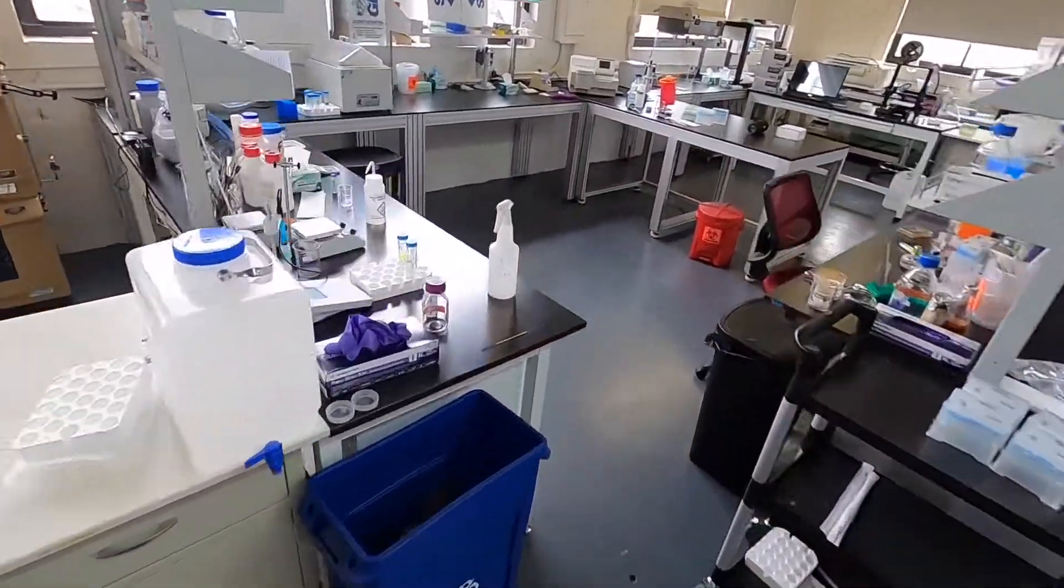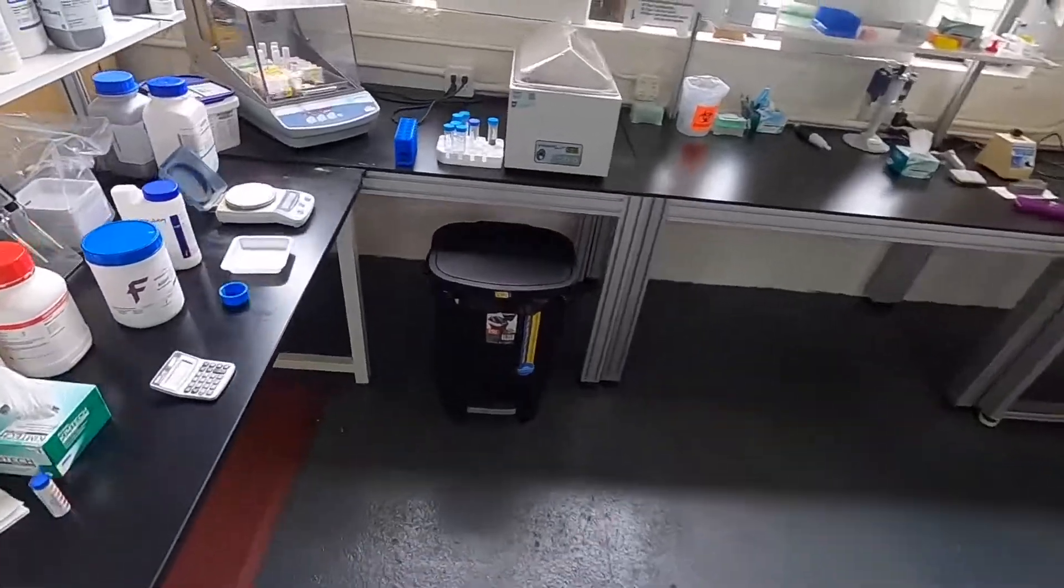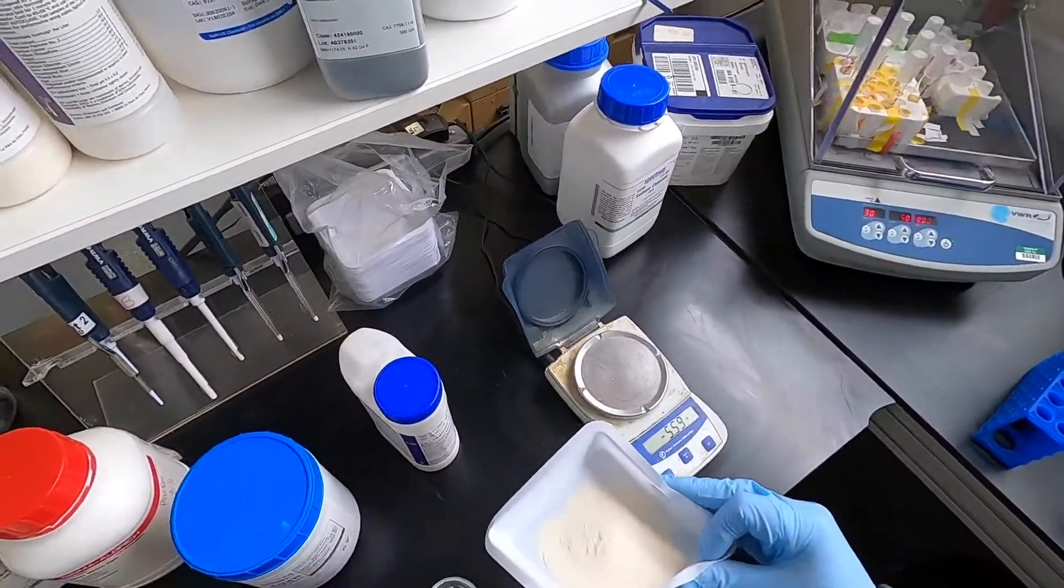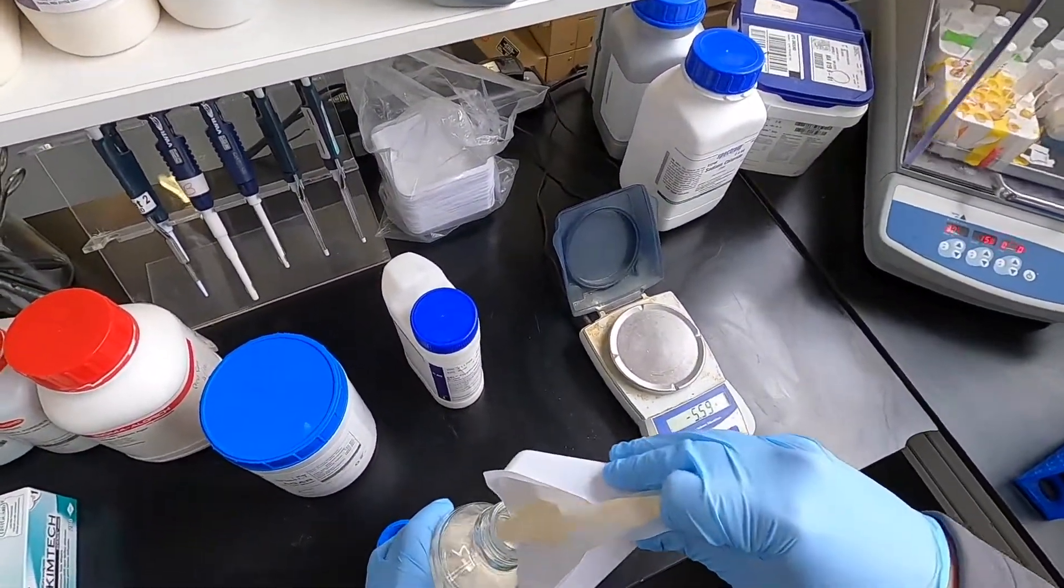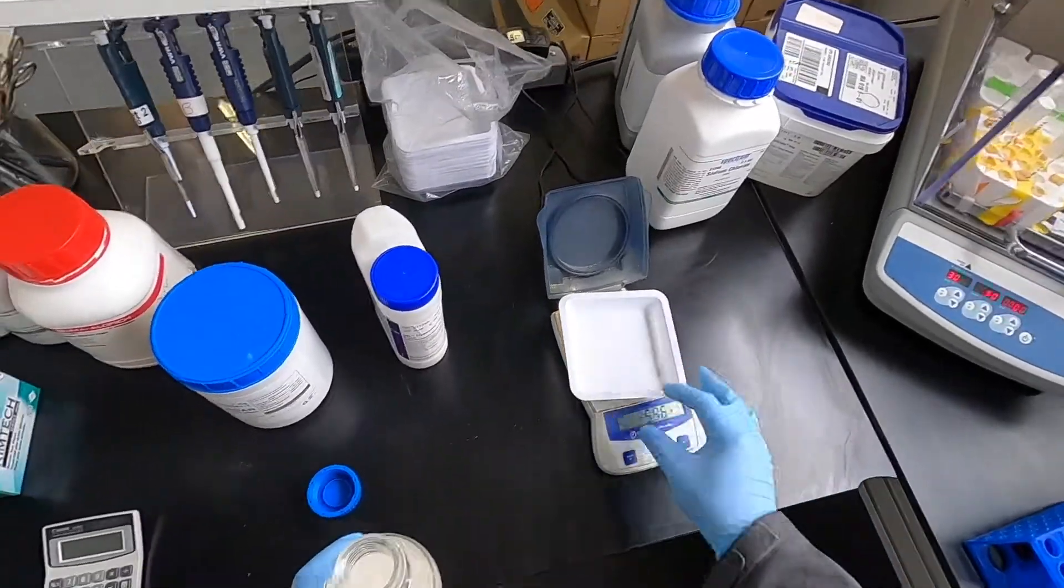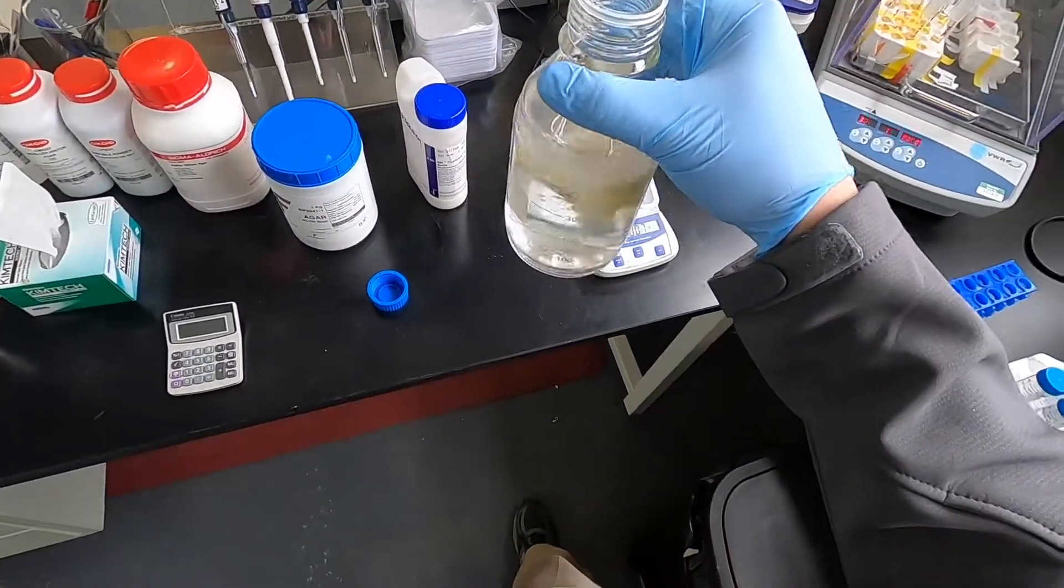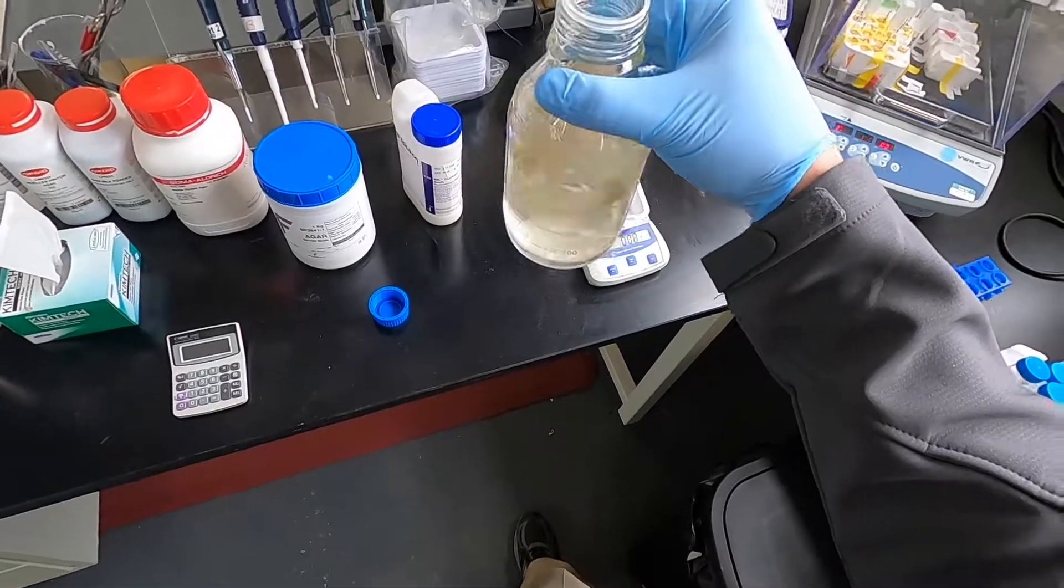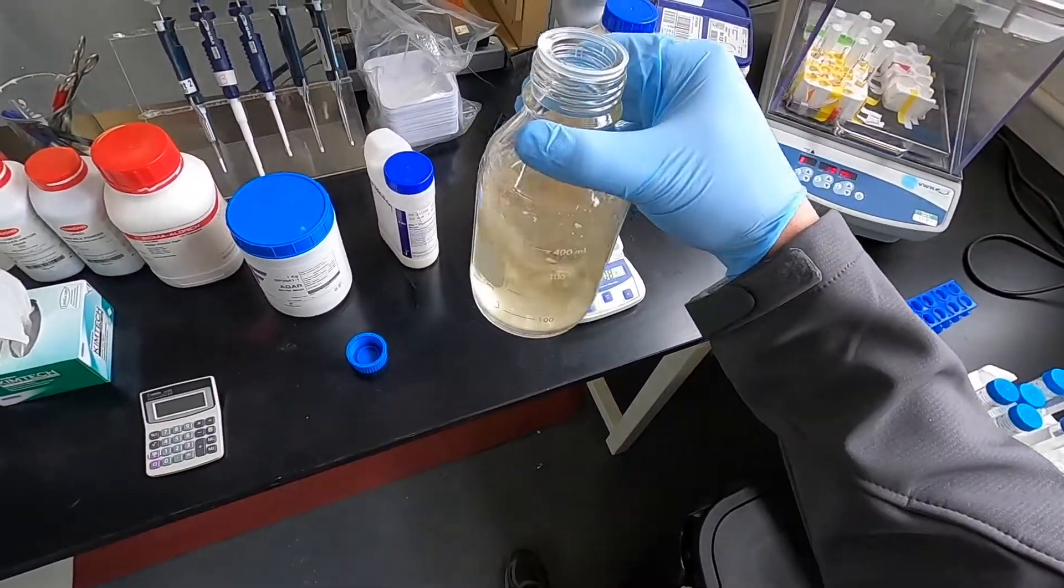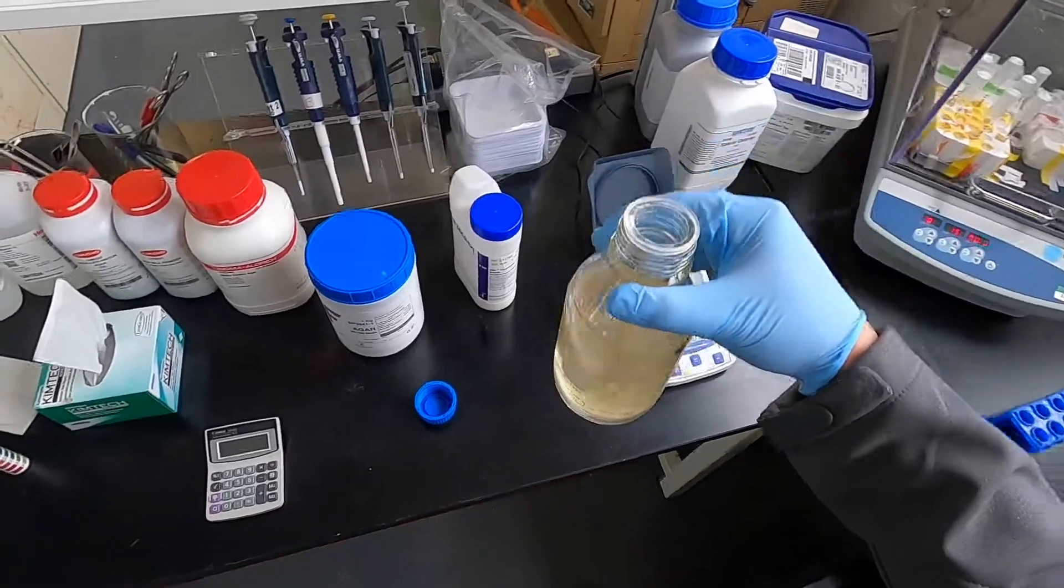So we'll start off by putting in about half volume of deionized water, then we will put in the broth. Yes, it makes chunks but they're not dry and stuck to the bottom, so when it autoclaves it won't actually burn.